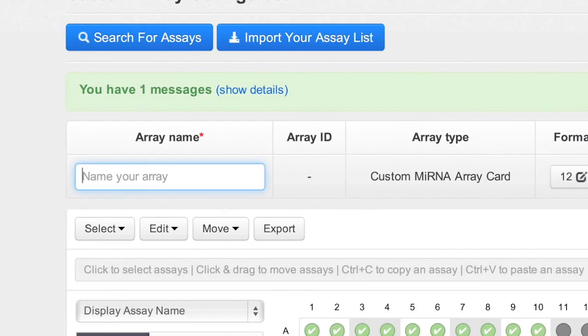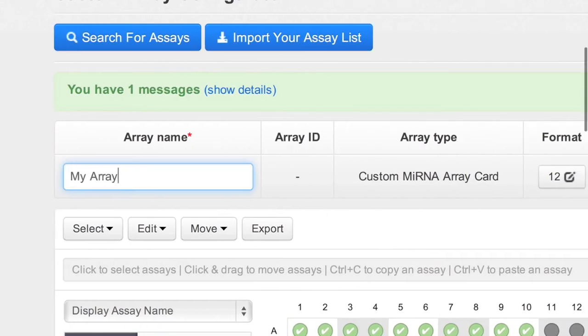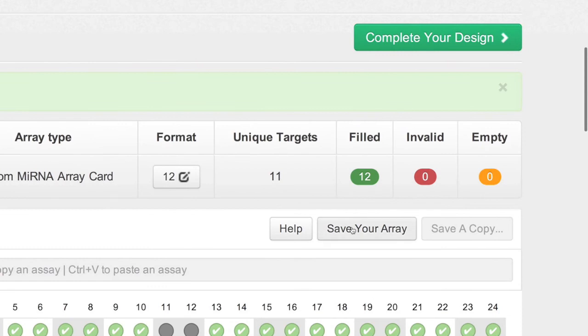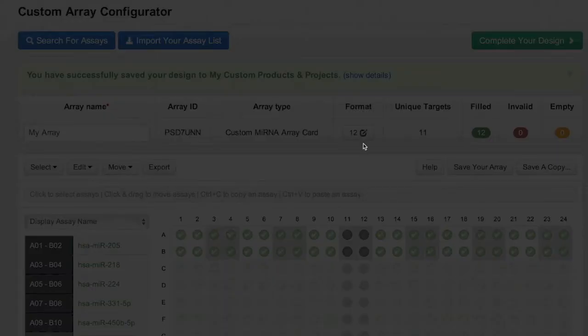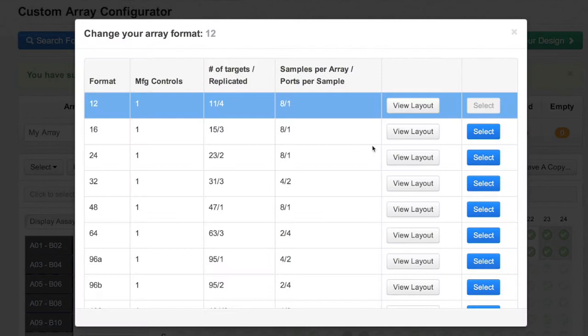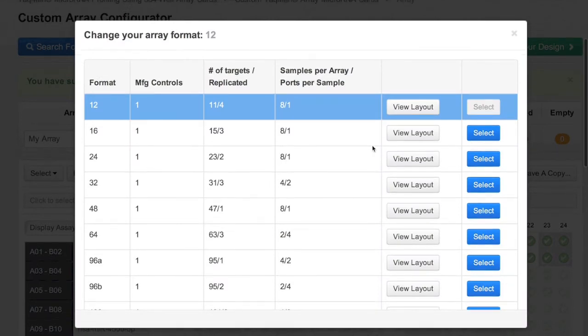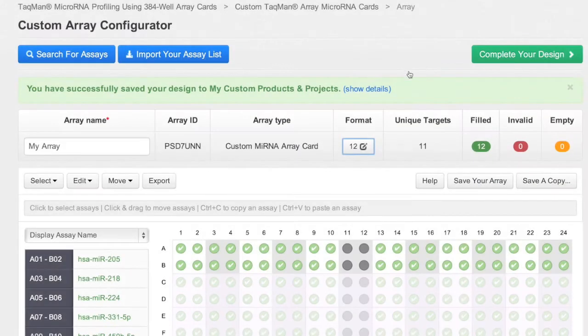Next, name and save your array design. The format can be changed at any time, and you can even make changes subsequent to new additions or modifications. Once you're happy with your card, click Complete Your Design.